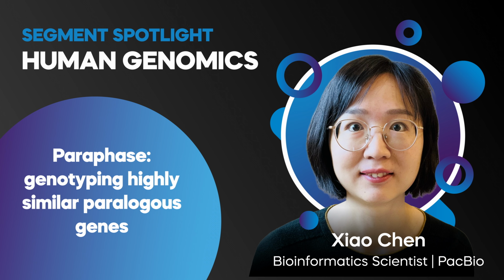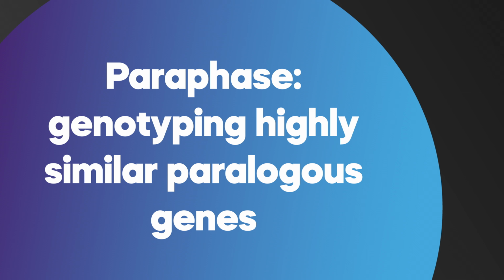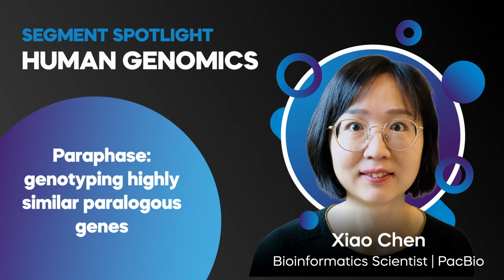In this presentation, I'll be talking about using a PacBio tool called Paraphase to genotype highly similar paralogous genes.